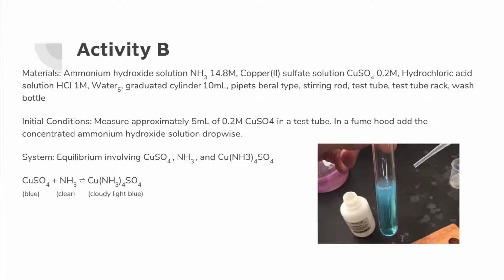Alright, so here's the system. It's copper sulfate reacting with ammonium hydroxide to form the copper compound. And the copper sulfate is blue, with the ammonium hydroxide being clear and the compound being sort of a cloudy light blue.